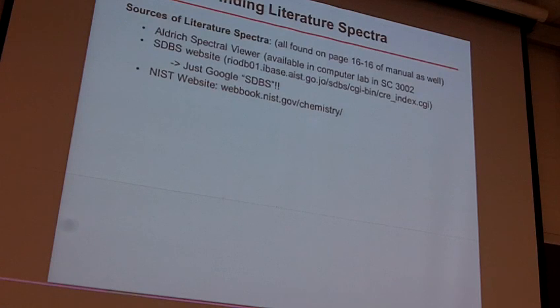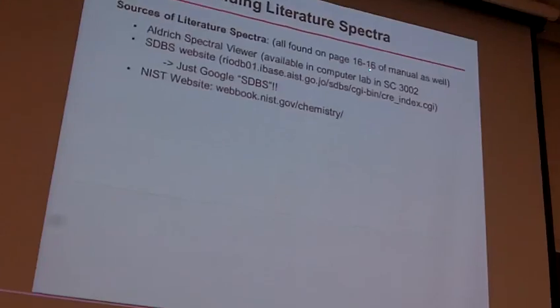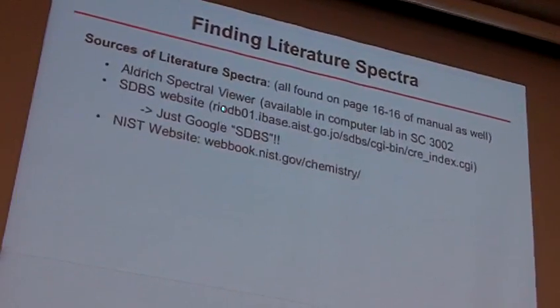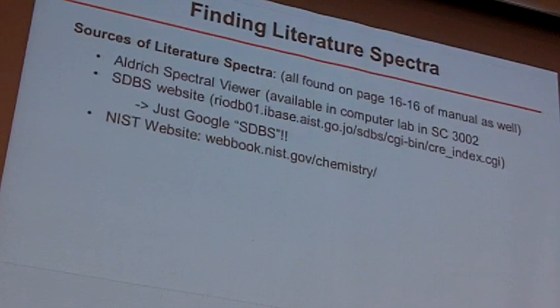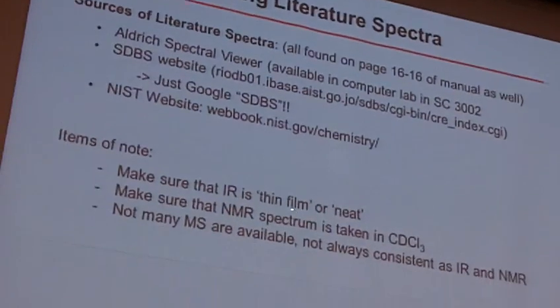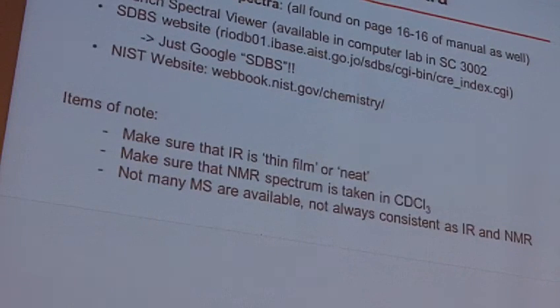Finding the literature spectrum for each compound: if you look on page 1616, that will tell you where you can find them. These are three different sites that are useful. Just Google SDBS. I will tell you that's my go-to for about 98% of spectra. So I Google SDBS, pull that up, look at the NMR. One thing to be careful of is to make sure that the IR is thin film or neat. You've run into that one already and seen the different varieties.